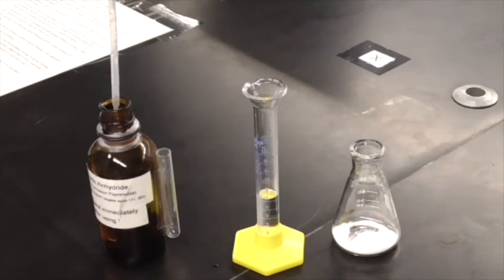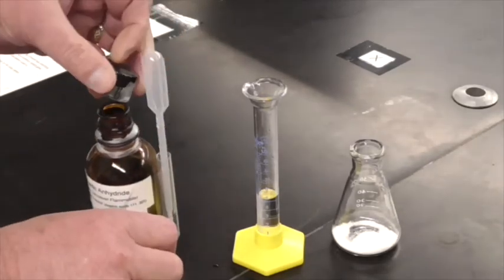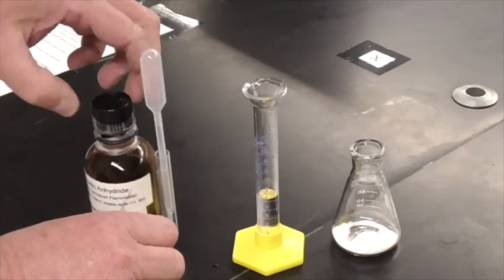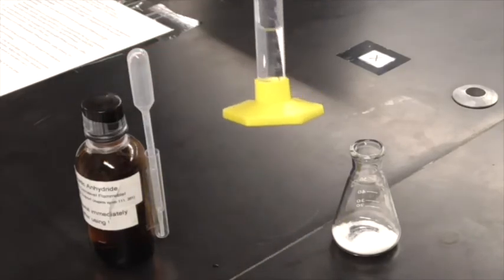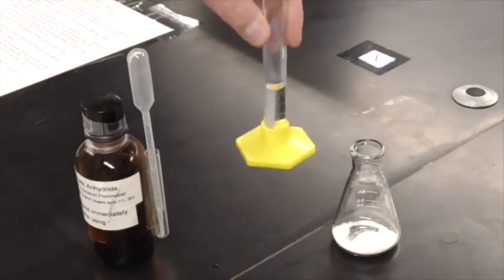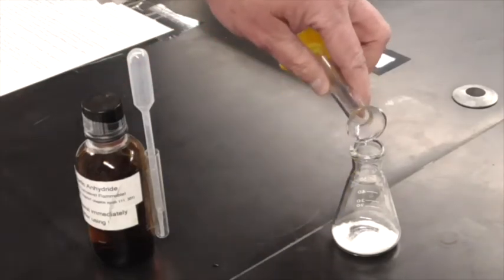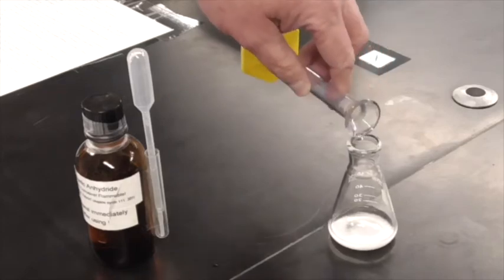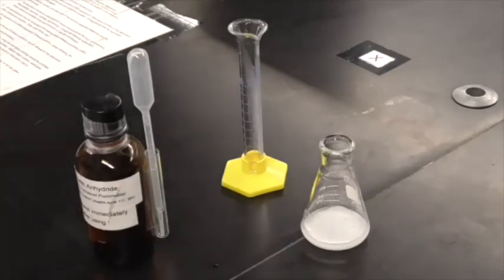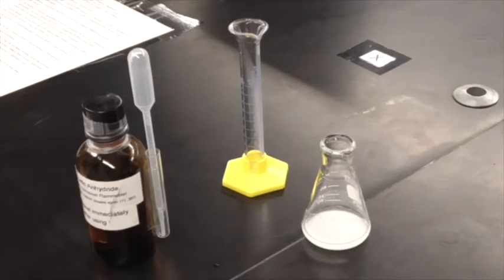Alright, so we're adding enough acetic anhydride that it's actually the excess reactant, so that our limiting reactant will be the salicylic acid. So this is about 5 milliliters. The meniscus is right at the 5 milliliter line. So we're going to add that to our salicylic acid, and that should start to dissolve. And now we're going to go over to the hood and add 5 drops of sulfuric acid.